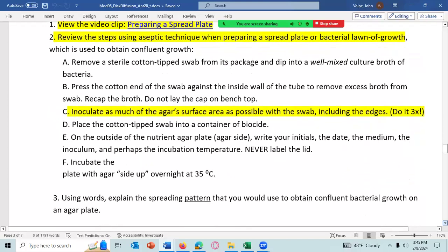And then you let the plate sit for 5 minutes so that the liquid containing the bacteria will be absorbed by the agar. And then you put the paper disc containing the antibiotics down. And within 15 minutes after putting the bacteria on, you should have all the paper discs down on the plate.